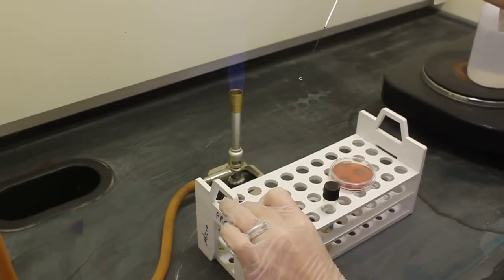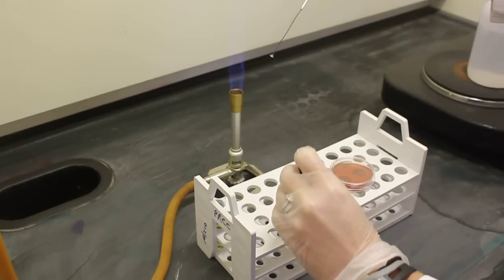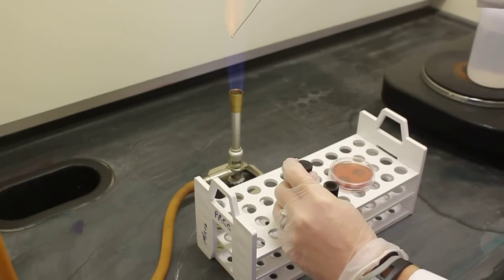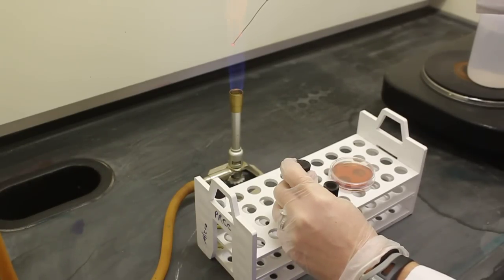To inoculate the slant, I will use the same procedure, re-sterilizing my loop. Even though I am going to be using the same bacteria, you cannot double dip the loop. You always have to re-sterilize the loop.